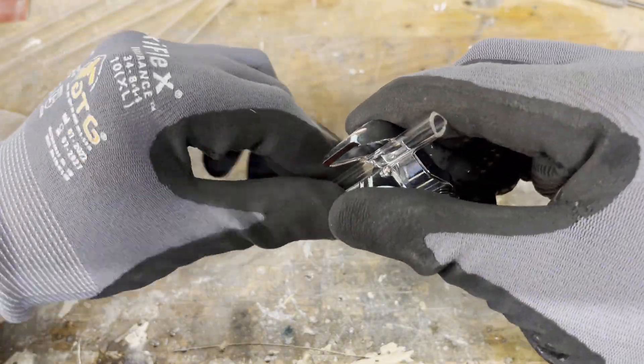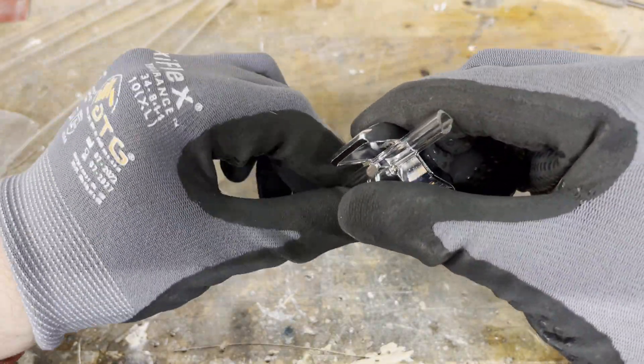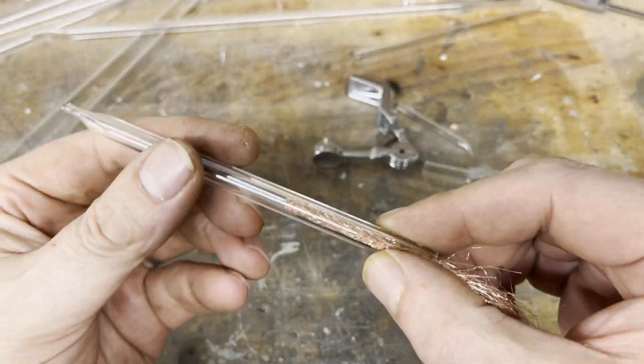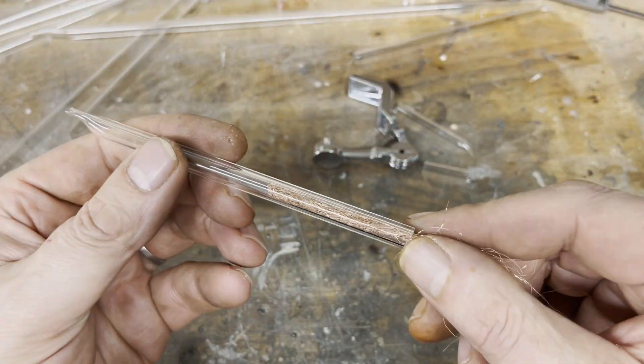First I made the flame tube. Copper wool is used as a flashback arrestor.